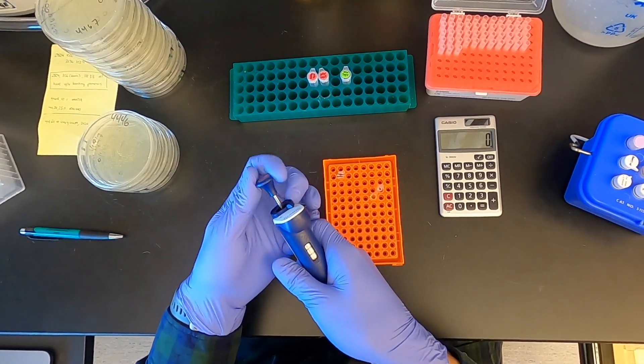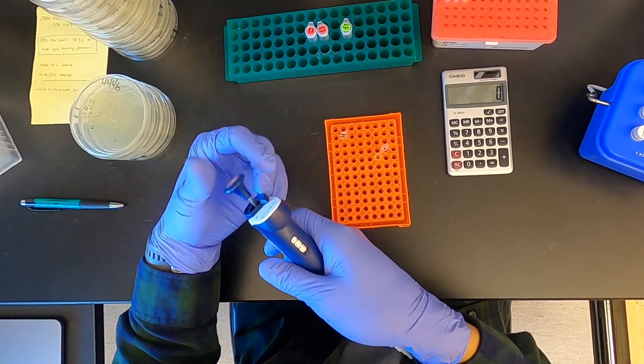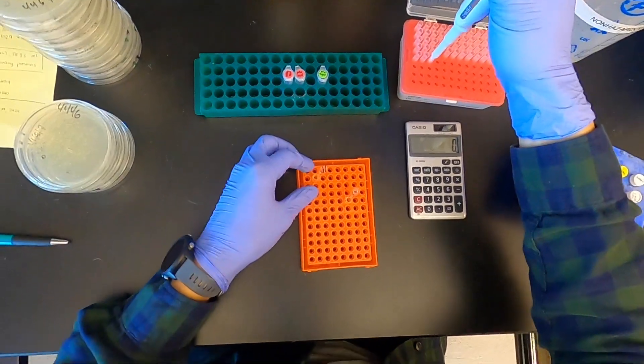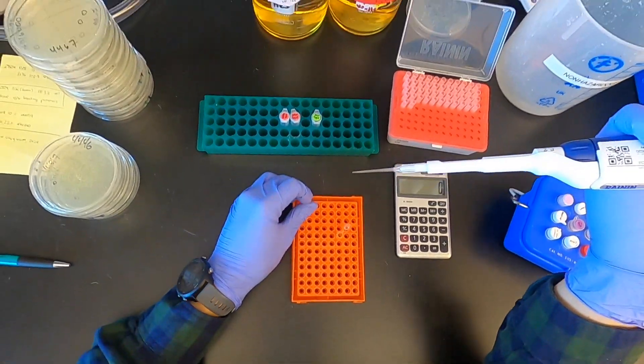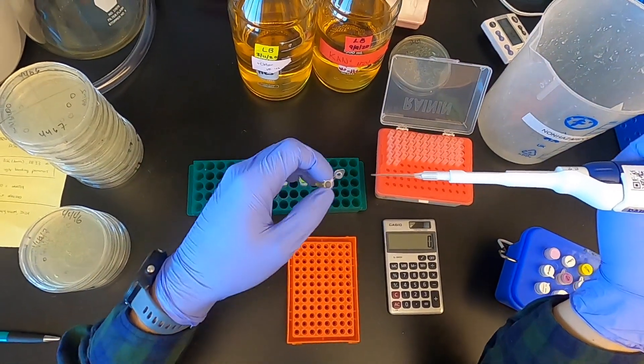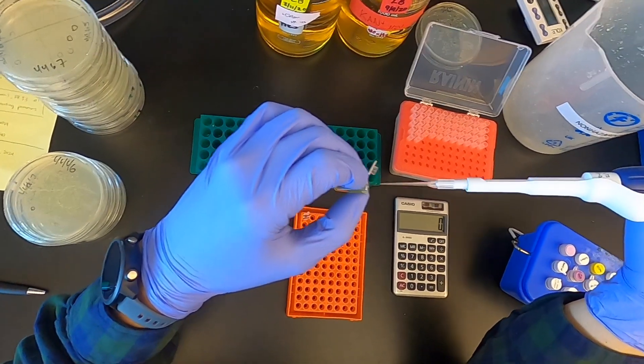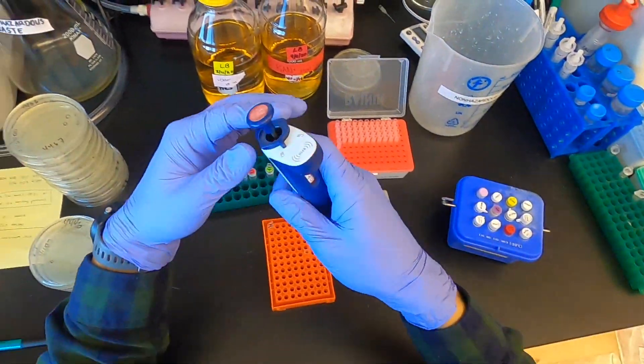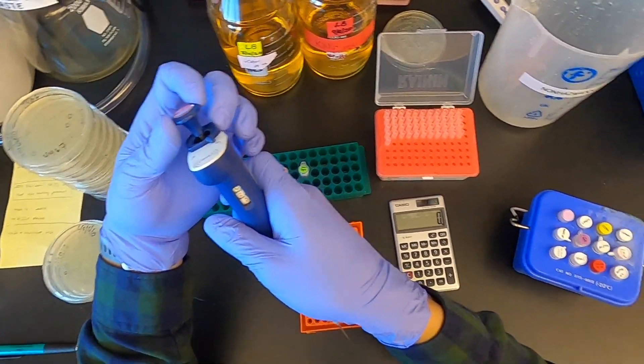Next I'll add my ligase buffer, 0.5 microliters. When I'm pipetting these small volumes, I always visually confirm to make sure that the correct amount of liquid is in the tip, and then I also visually confirm to make sure that liquid has been expelled from the tip. You'll see that this becomes more important for really viscous things like enzymes.